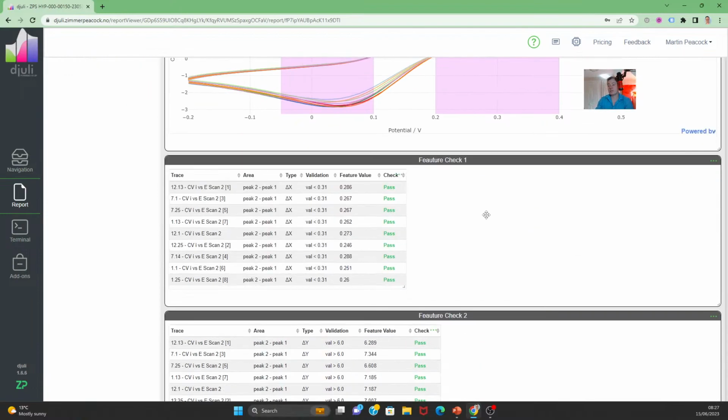Nothing gets shipped unless it goes through a pass criteria. We're looking at peak position, we're looking at peak height. So we always test in the same way. We look at peak height and peak position. So it doesn't matter where the sheet is, it's got to pass this pass criteria. And then what we know is that within a sheet, our relative standard deviation is 5%.